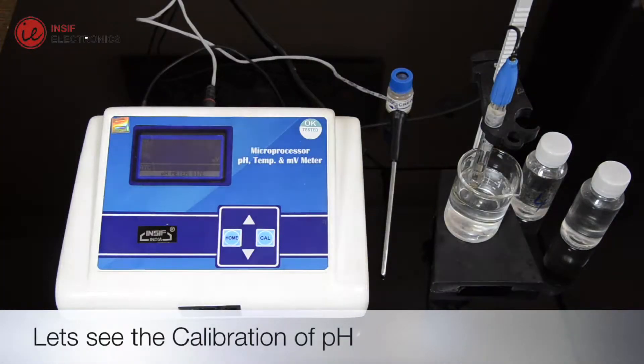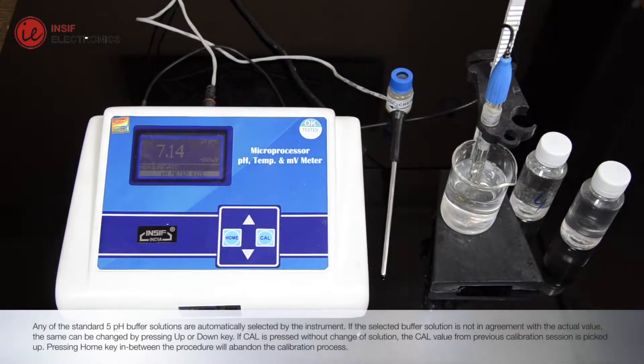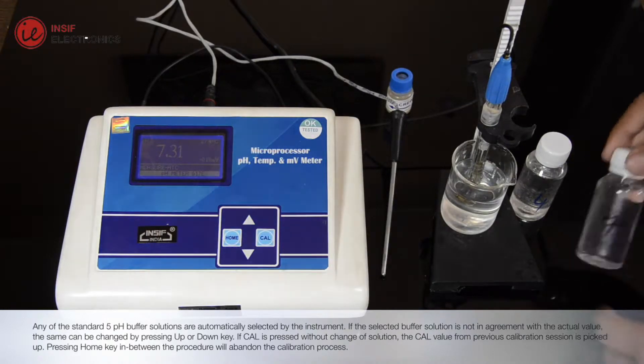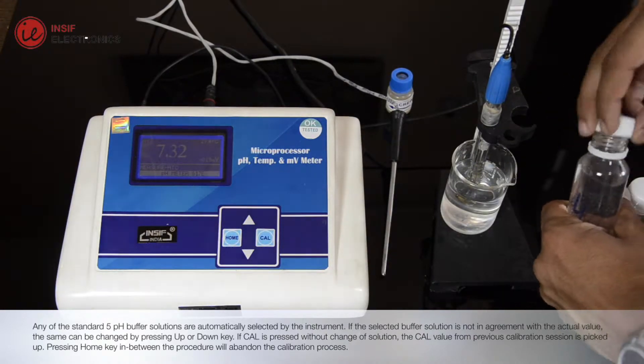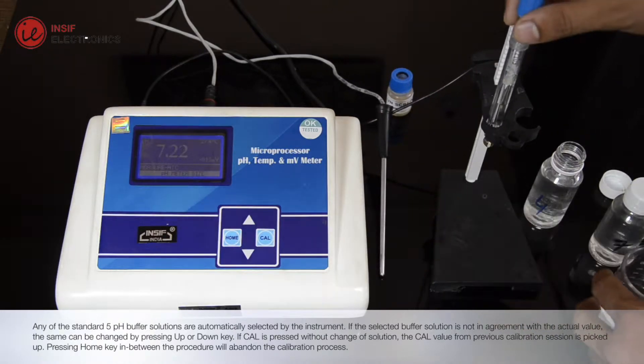Let's see the calibration of pH meter. Any of the standard 5 buffer solutions are automatically selected by the instrument. If the selected buffer solution is not in agreement with the actual value, the same can be changed by pressing up or down key.